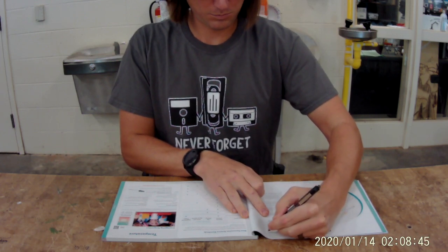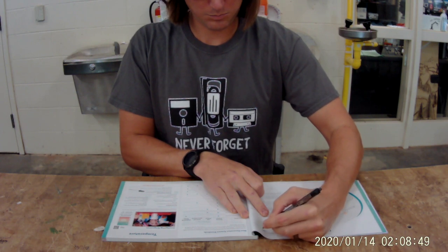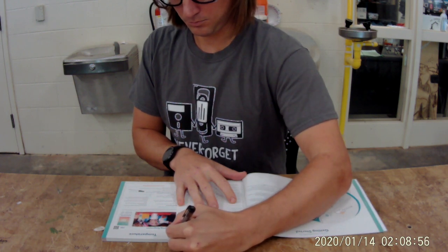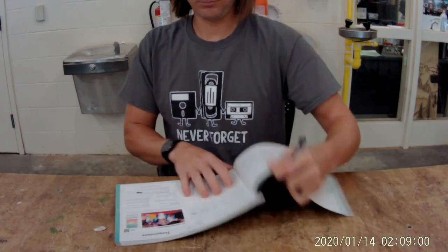Students are not permitted in laboratory storage or supply rooms or teacher workrooms unless directly instructed to do so. Horseplay, running, pushing, shoving, and practical jokes will not be tolerated. Students should never touch or handle laboratory animals without permission from the teacher.